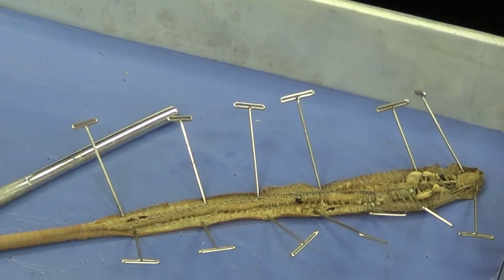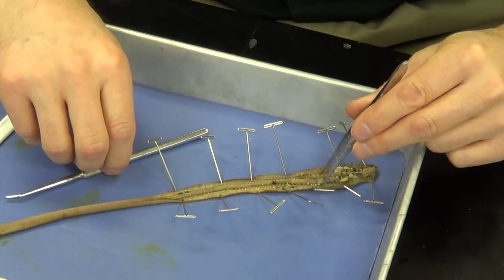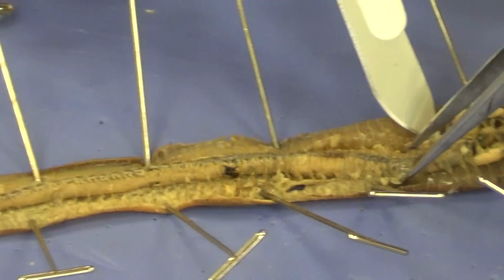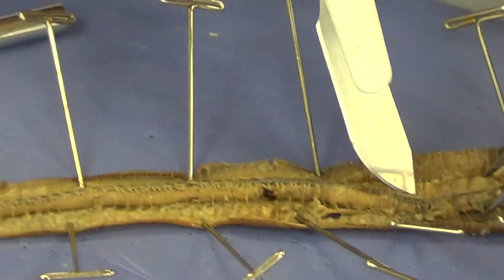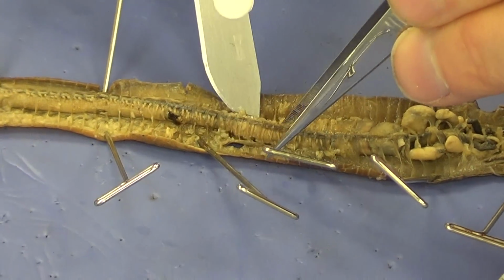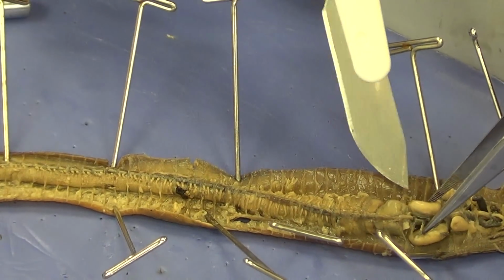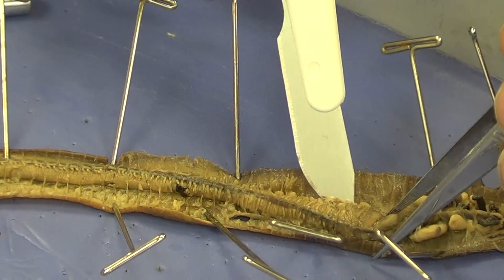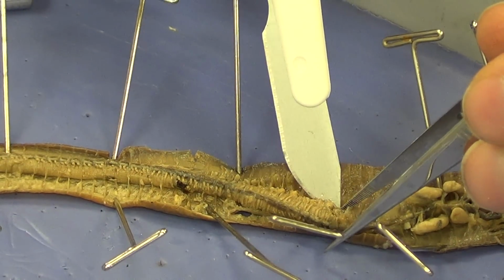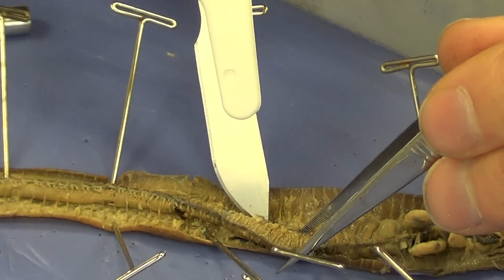Now, the last thing we need to do is roll this intestinal tract, this digestive tract, out of the way a little bit. I don't just want to cut it up, but I want to roll it out of the way. So I'm going to take my forceps and pull it over just a little bit, and cut some of the septa that are holding it in place. Again, keep doing that very gently, and I want to do this towards the anterior of the worm because this is where my largest structures are going to be. And what I'm looking for here is the nerve cord. I'm looking for a white fiber. It looks like a white thread. And I very gently keep pushing it over, cutting the septa that are holding it in place.